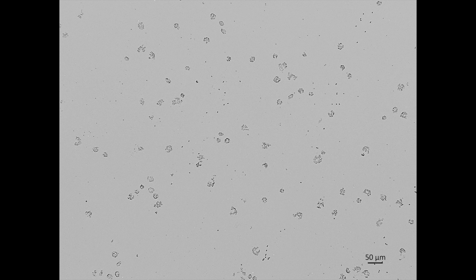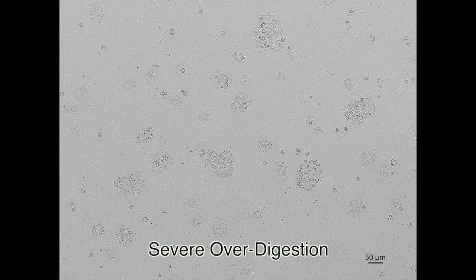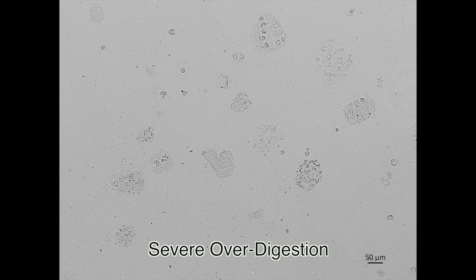As overdigestion becomes more severe, chromosomes can no longer be assigned to a specific metaphase spread, and the slide cannot be used. In extreme cases of overdigestion, aggregates of cytoplasm begin to form, and cell boundaries become irregular and amorphous. As overdigestion proceeds, the aggregates become larger until eventually what remains is mostly debris.